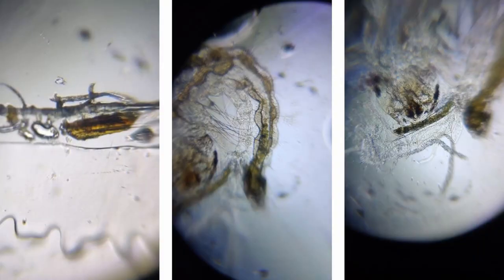Identify any life forms that you might find in the water sample that you collect.